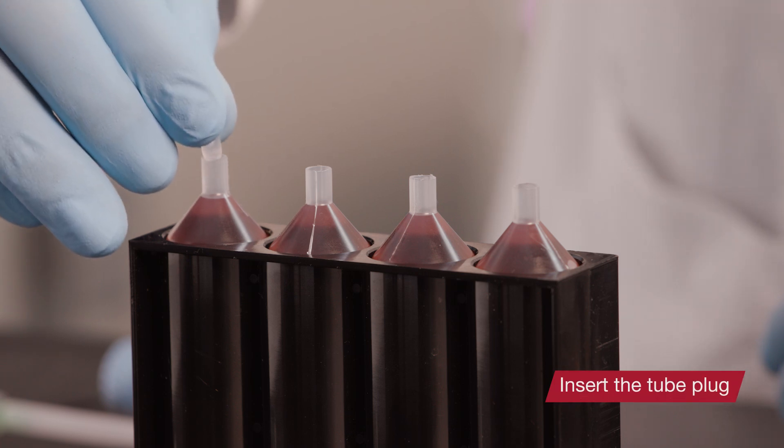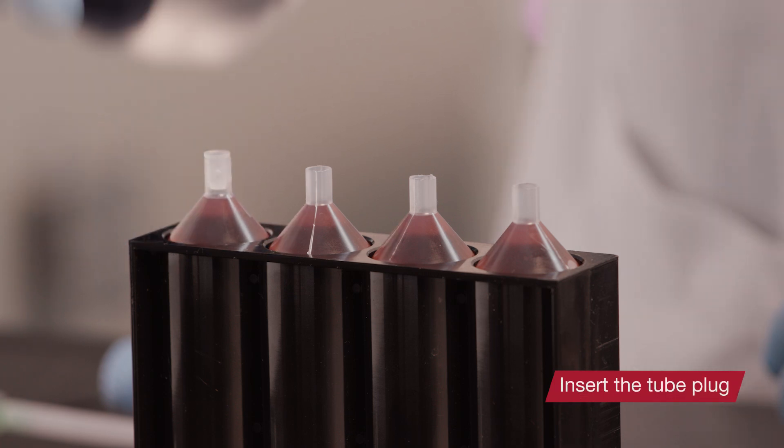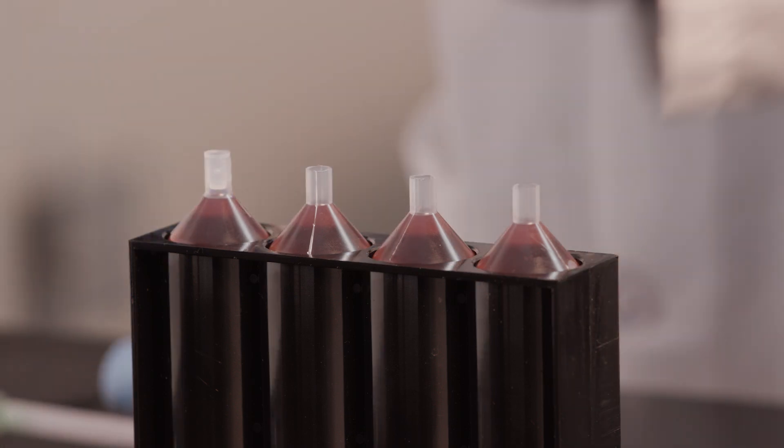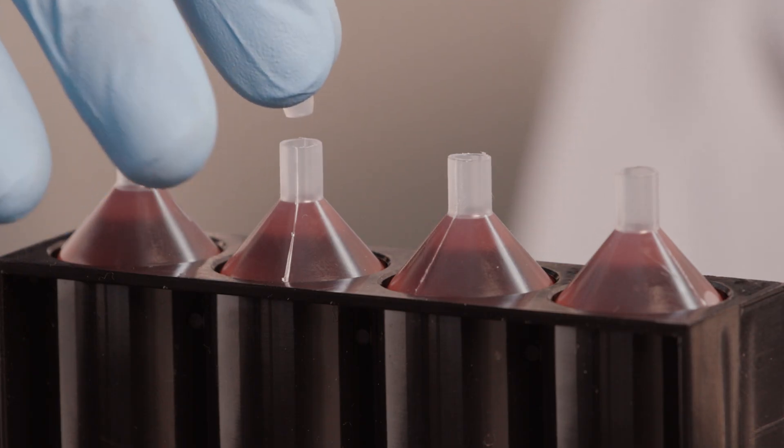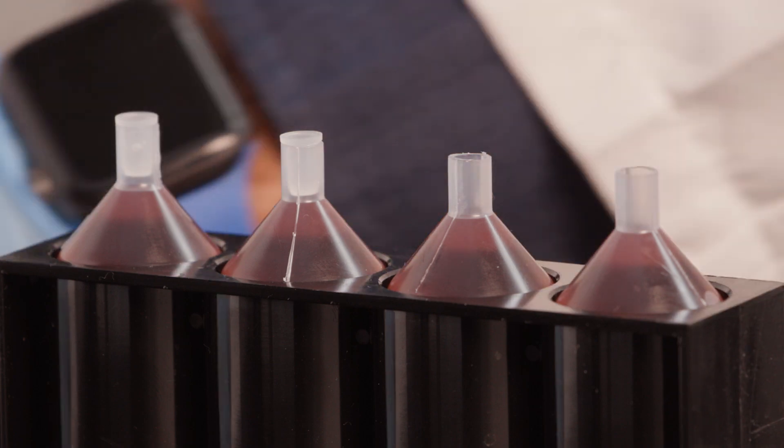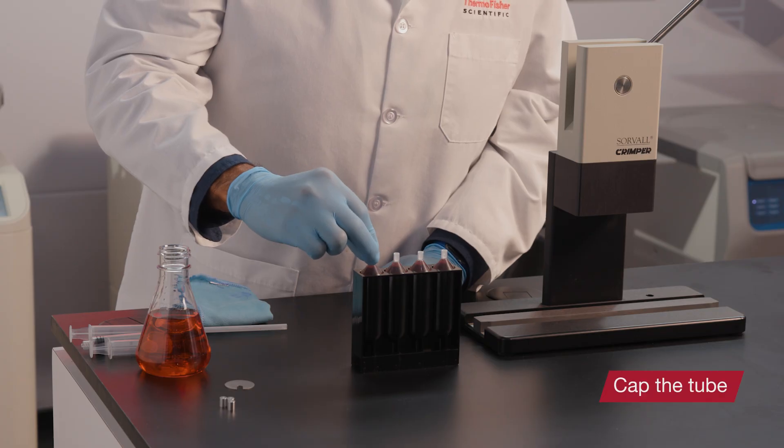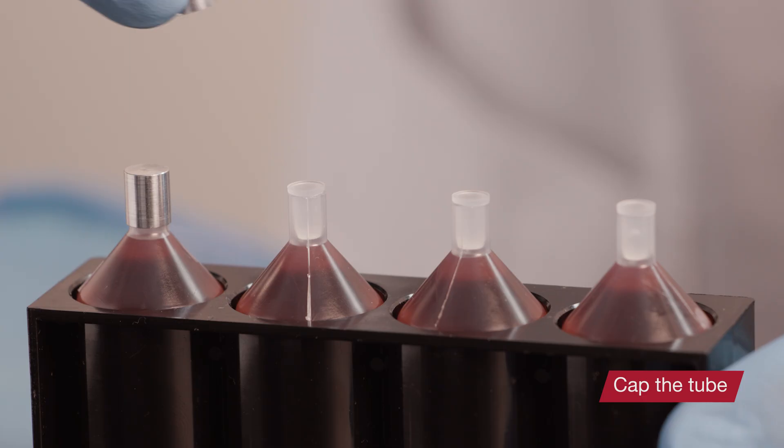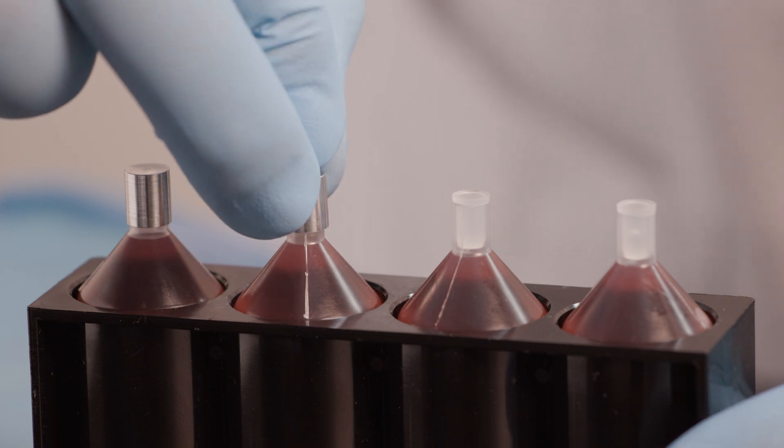Next, insert a tube plug completely into the tube neck. The fluid level in the tube should be approximately 1.5 millimeters below the bottom of the plug. Place an aluminum tube cap over the top of each plugged tube.